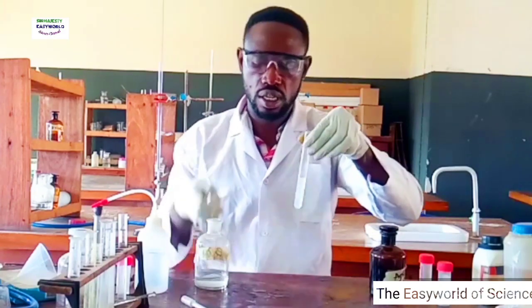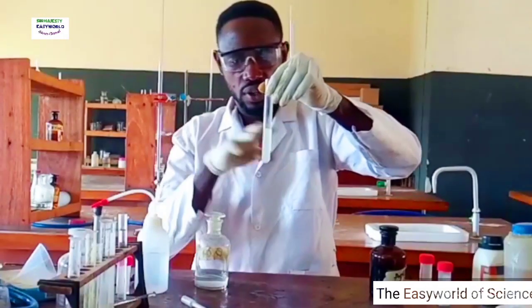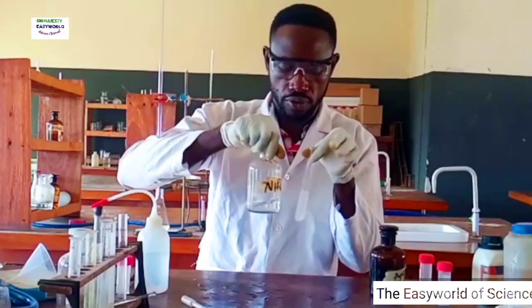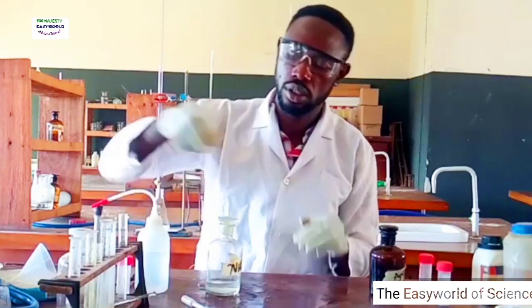So it dissolves in excess aqueous ammonia. This is giving us light turbidity. Maybe the excess calcium chloride remaining is still showing some reaction with aqueous ammonia. Of course, that's what is just happening here. If not, there's supposed to be a very clear solution.